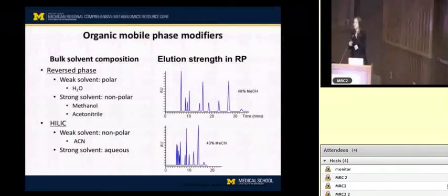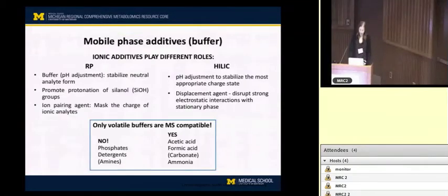And interestingly, in HILIC, we have the exact opposite effect of acetonitrile and methanol. So adding methanol to a HILIC mobile phase actually decreases the retention time. I'm going to skip over this pretty much, just saying that we use buffers in HPLC usually to stabilize the ionization state of our analytes, because this state has an important influence on the separation.